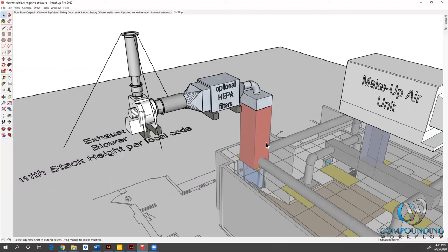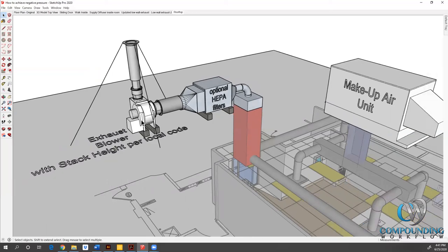You can see we've got those two low wall exhausts getting pulled into our duct, making the transition to the roof through optional HEPA filtration. And then it's going to get ejected at a certain velocity out of what we call this stack here via our exhaust blower.